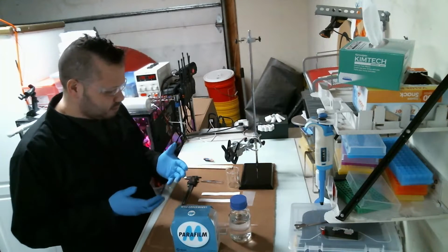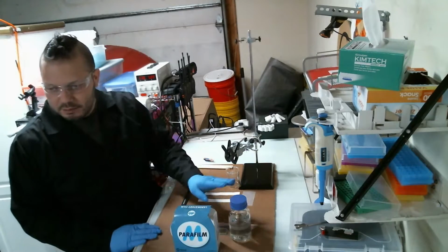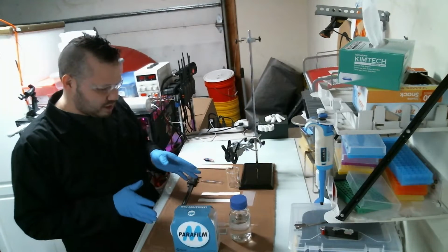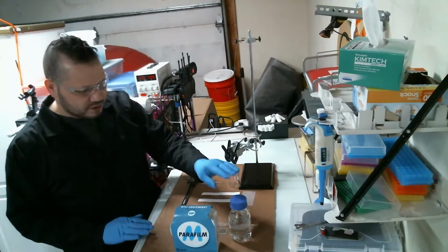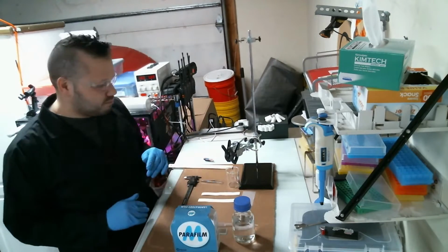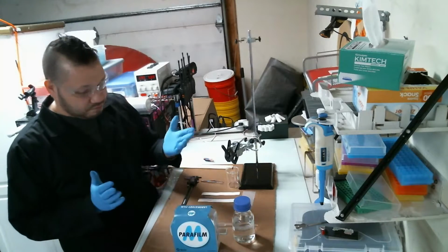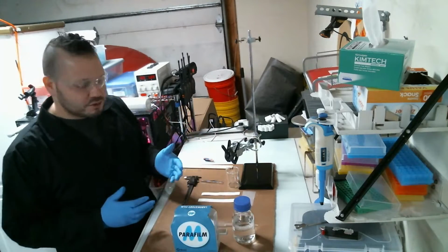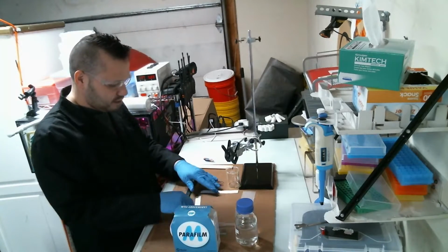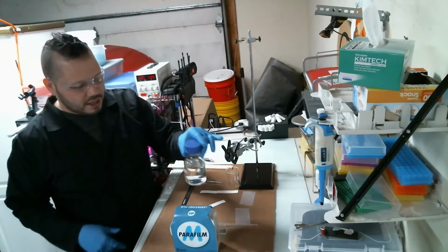a test. Now, the end goal is to be able to hopefully detect indole acetic acid, and I'll be using a solution that I have here, which, because this is something I'm trying to come up with myself, a different way of doing something, I'm not going to let you know what this is, just in case I end up publishing it, because journals don't like when things you submit already have published results elsewhere. But essentially right now I'm going to be soaking these chromatography papers with this solution, and then I'm going to let it dry.